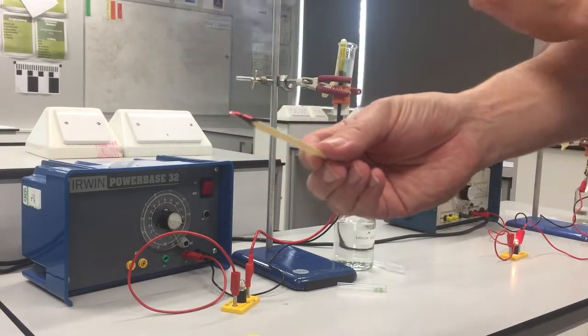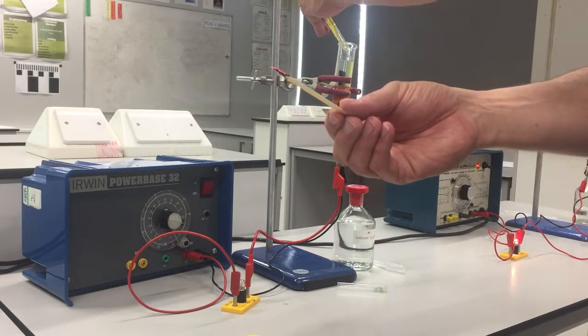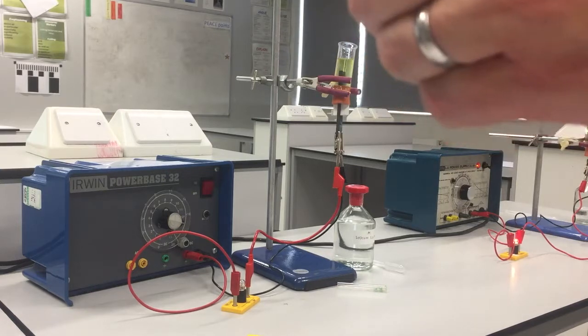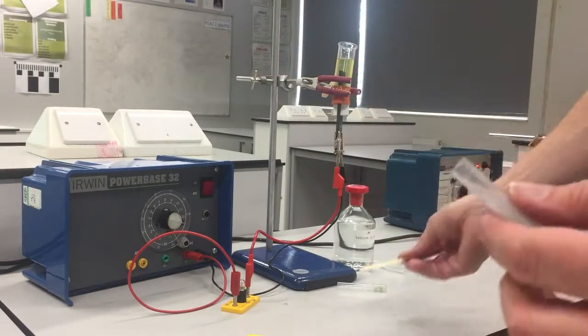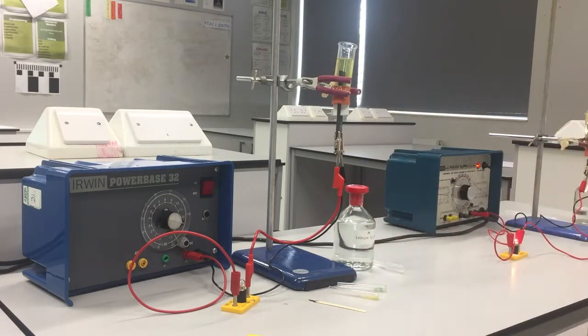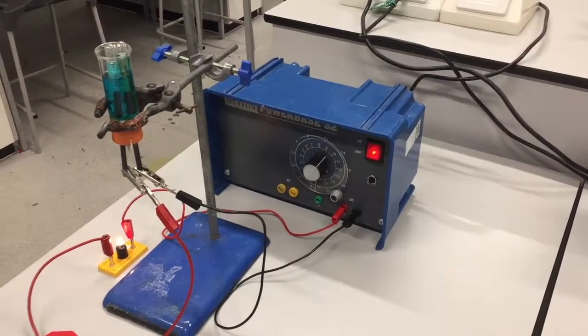And then when you put that into the oxygen, which we should have had formed here, that will reignite, but I don't think we've got enough. Oh, it is glowing slightly. It glowed slightly, but it will reignite if there was enough oxygen present. So that's required practical 9.